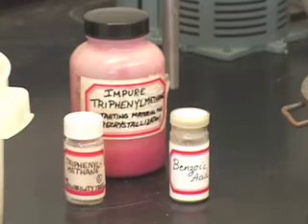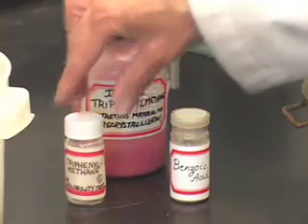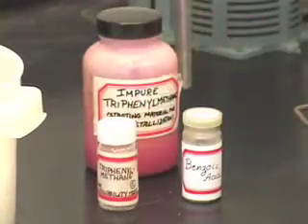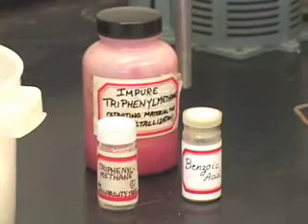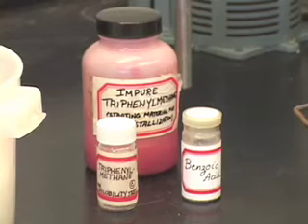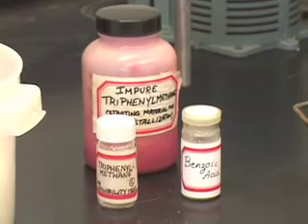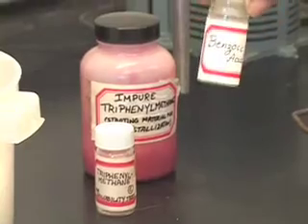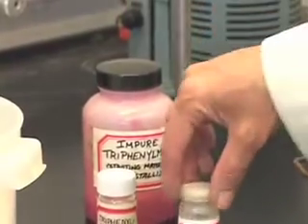So, when you do the solubility test on the standard triphenylmethane and come up with the solvent, please do check with the instructor to make sure that you have selected the right solvent. So, let us go on and determine the solubility or the solvent for recrystallizing benzoic acid in this case here.